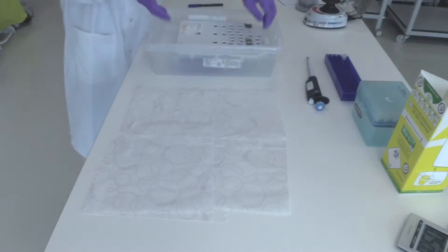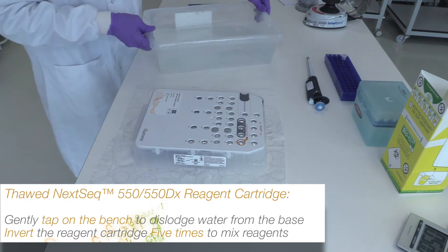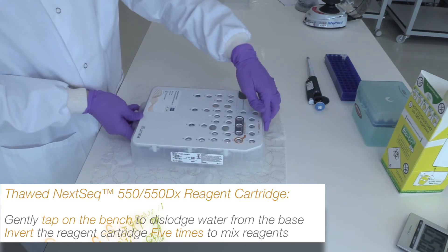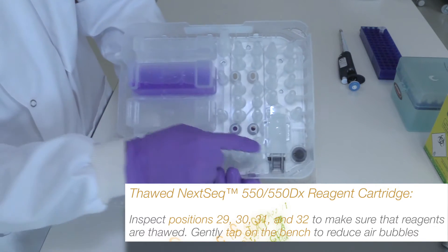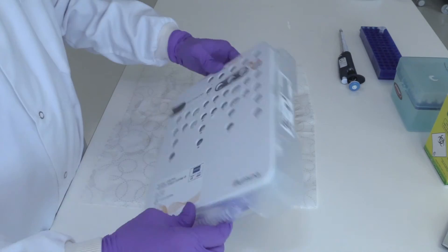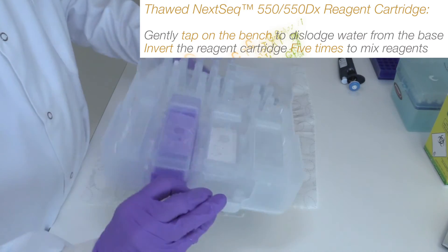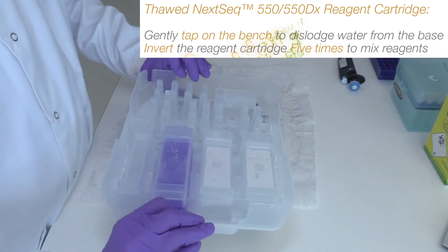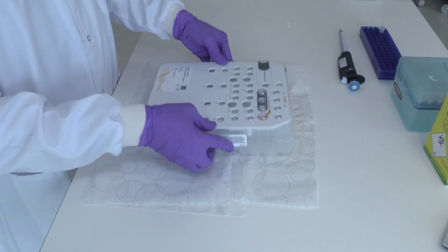After thawing the NexSeq 550 550DX reagent cartridge for a minimum of 60 minutes, gently tap on the bench to dislodge water from the base and then dry the base. You can now inspect positions 29, 30, 31, and 32 to make sure that the reagents are thawed. Then invert the cartridge 5 times to mix the reagents. Gently tap on the bench again to get rid of any possible air bubbles.